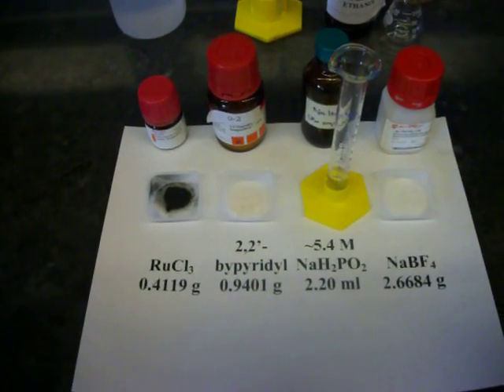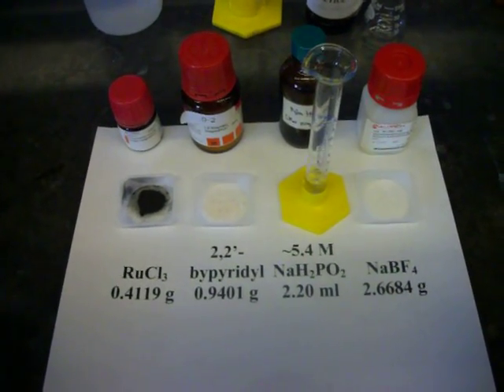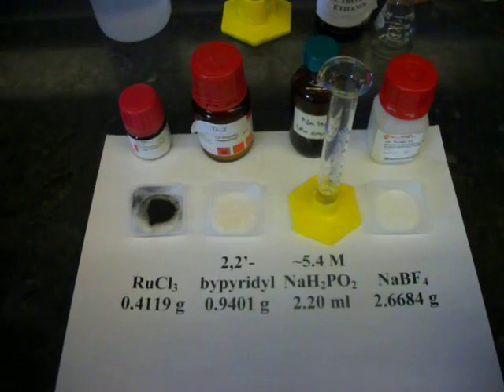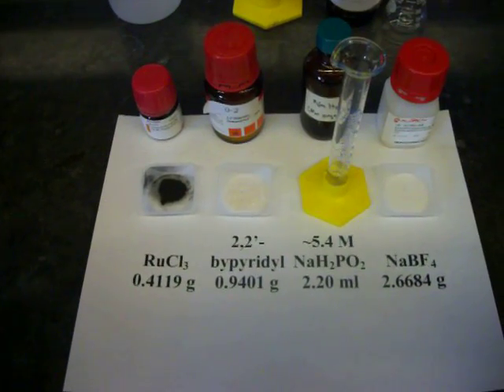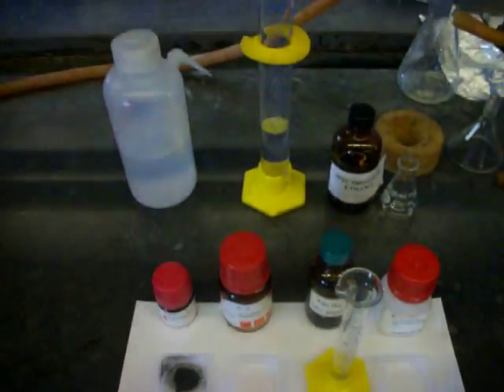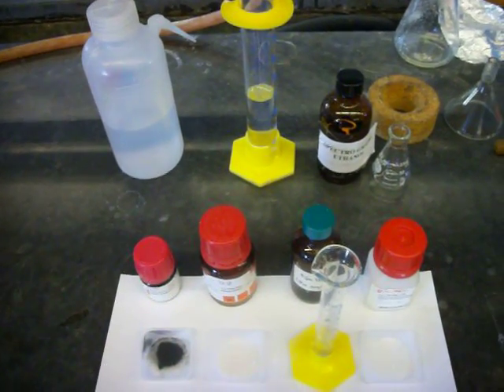Today we're going to be synthesizing the ruthenium semiconductor. The reagents are shown below: ruthenium chloride, bipyridyl, hypophosphorus acid sodium salt, and sodium tetrafluoroborate. In addition, we will be using water and ethanol for recrystallization.